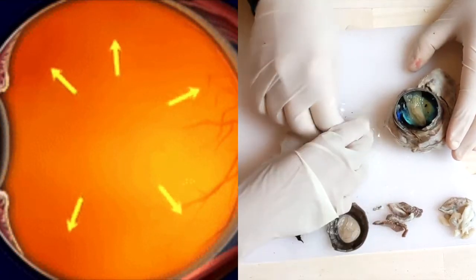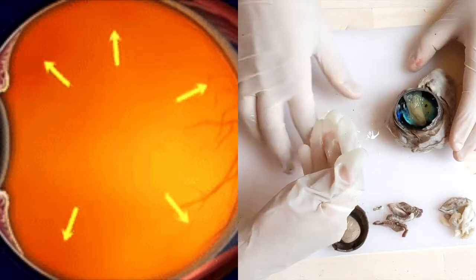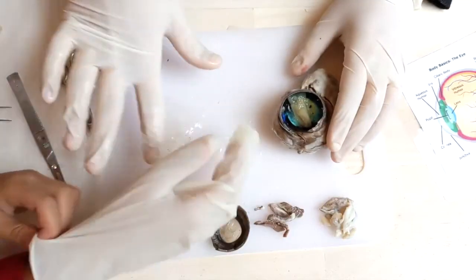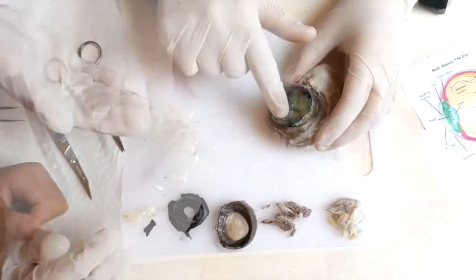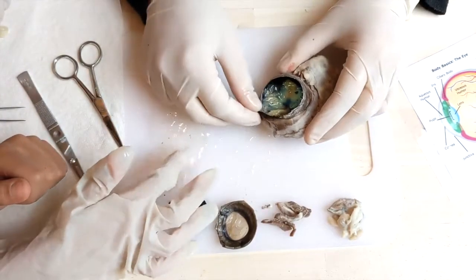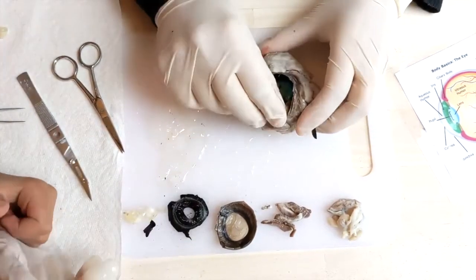What does that have to do with it? And the reason why it's jellyish like that is because it's made of protein. Protein is jellyish? Yeah, it gives that. Let's move on to the next part of the eye, and this is called the retina.